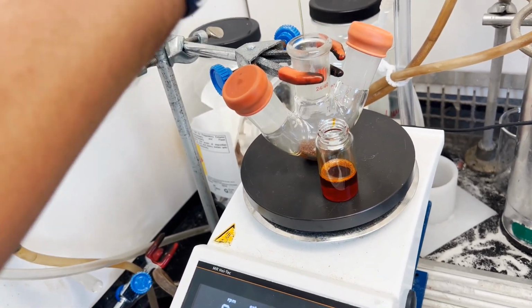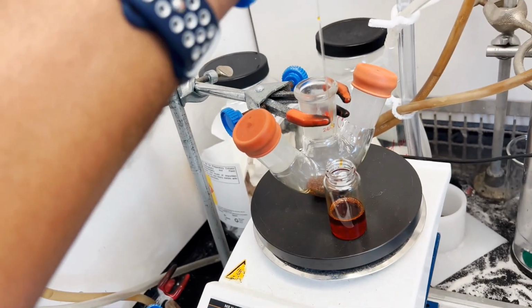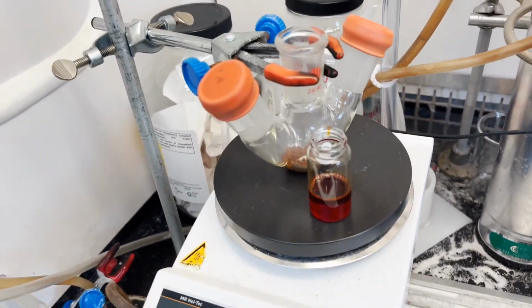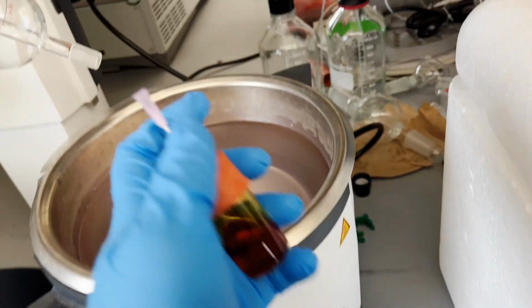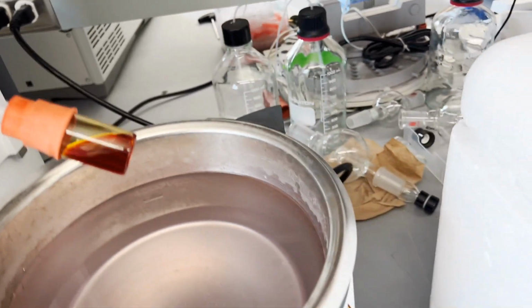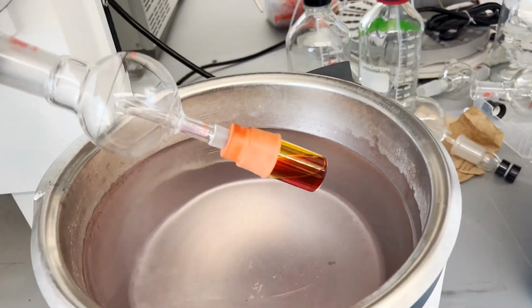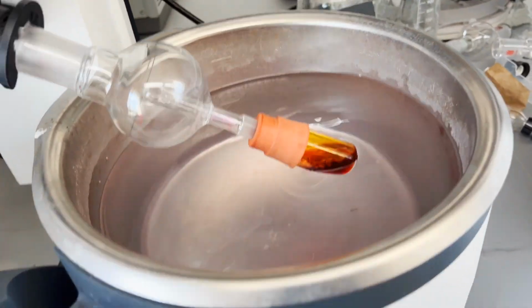These kinds of Schiff bases are normally stable around 40, 50, 60, even 70 degrees Celsius, but it depends. Different compounds could have different stability. So in that case, you can use the rotovap, and the water bath shouldn't be at too high a temperature. You can use 30 to 40 or 50 degrees Celsius maximum if your solvent is other than DCM, like methanol or ethanol. But initially don't try to use heat. Try to use room temperature.